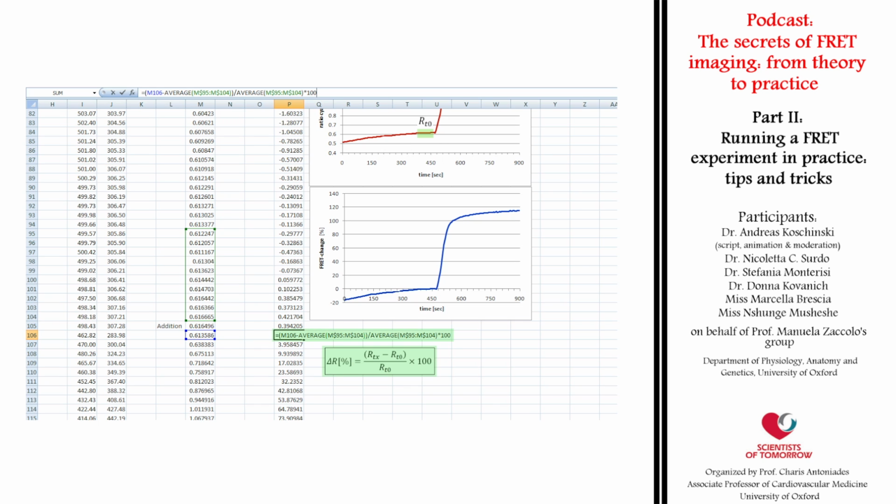If your curves would show nice plateaus before and after the stimulus, you would just subtract the FRET value before addition of your stimulus from the maximal FRET change, which would give you the stimulus-induced FRET change. However, here we have an underlying constant increase. The reasons for such drifting baselines often are not clear, but it's a quite common issue, and we have to take it into account if we want to calculate the FRET change induced by our stimulus.